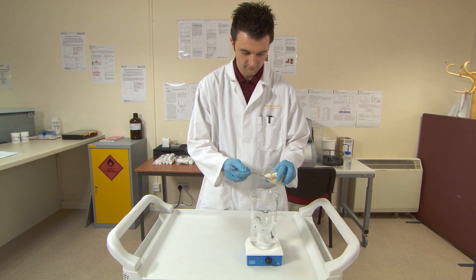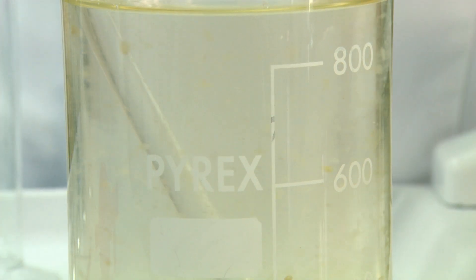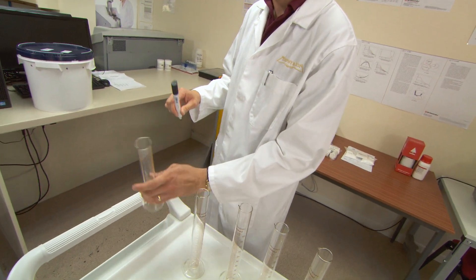To make a 0.1% solution, dissolve one gram of carrageenan into one litre of boiling water. Take your seven 100 millilitre measuring cylinders.